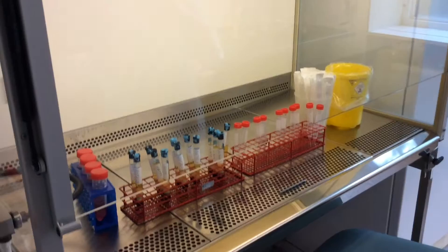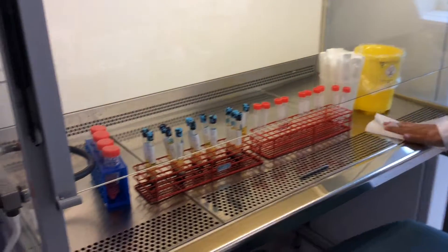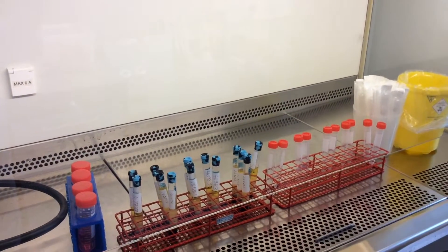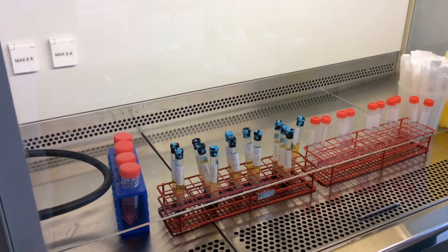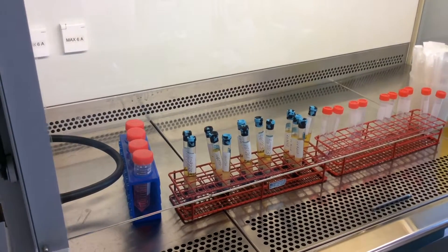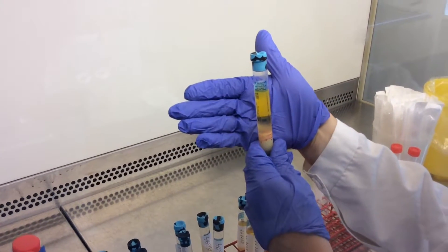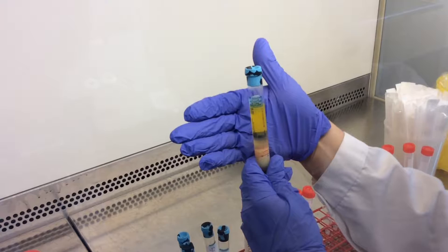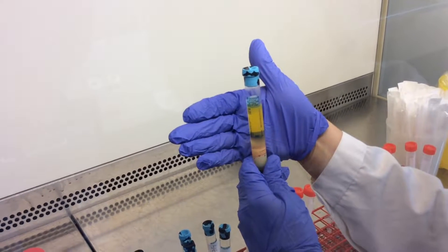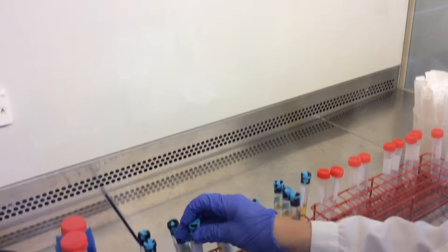Magdalena has done some preparation for the PBMC process and we will have a look at a tube to examine the different layers. Here we can see the upper layer, which is the plasma, and then there is a layer that contains PBMCs.